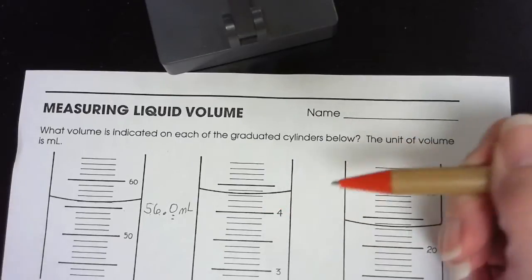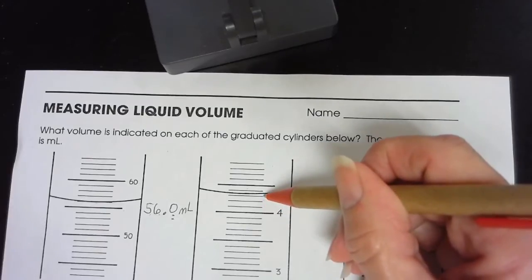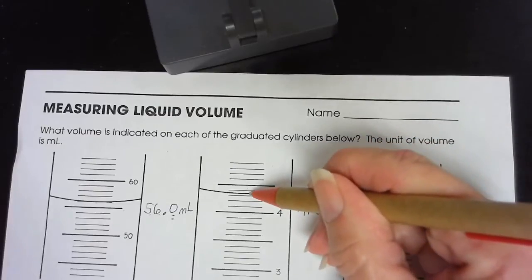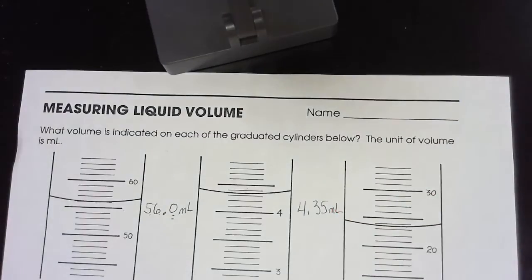Okay, so this one, the increments between 3 and 4 are going to be 0.1. So this is going to be 4.1, 4.2, 4.3. And I'm going to estimate that that is halfway between here. So I'm going to report that number as 4.35 milliliters.